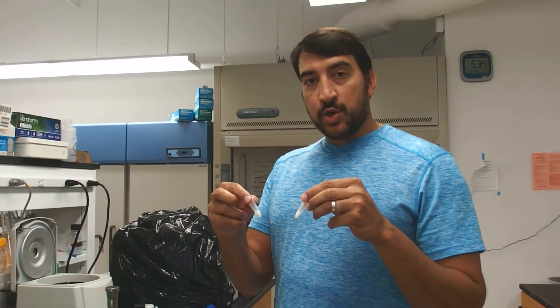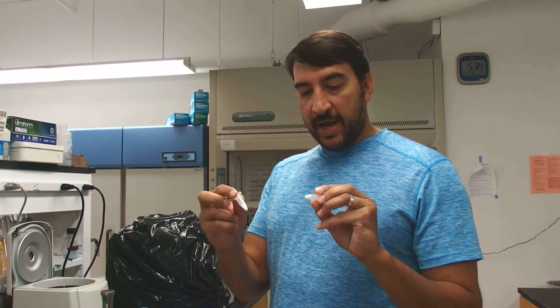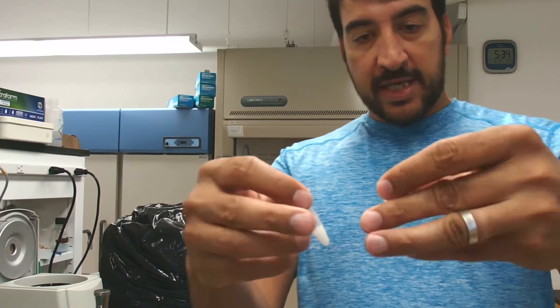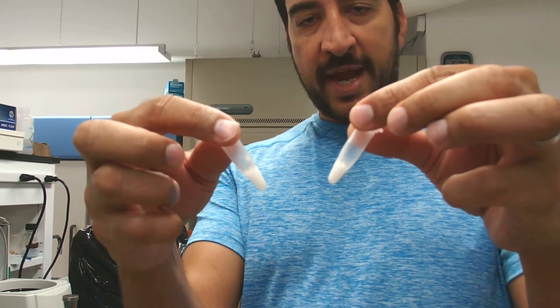We're going to show you how to do a transformation. Right now I have two tubes of frozen competent cells. You can see that they're still frozen, right out of the minus 80.